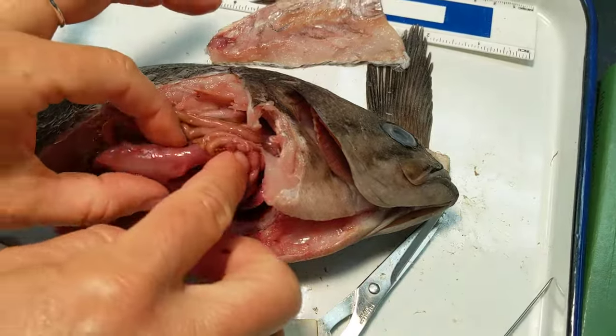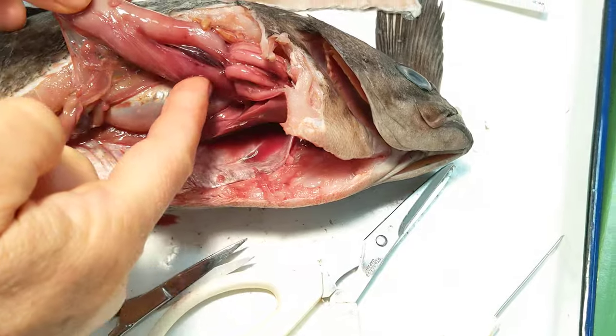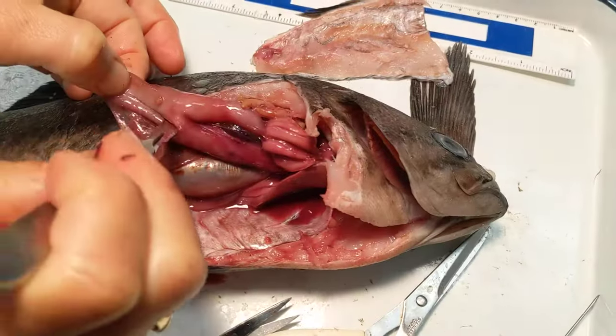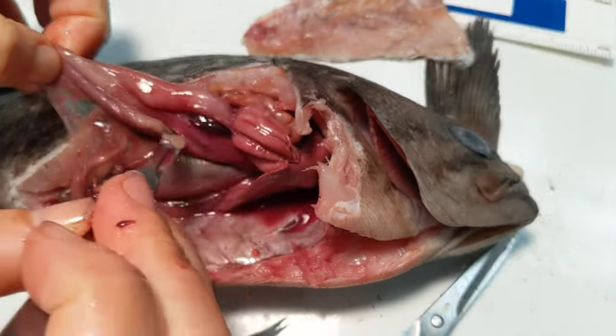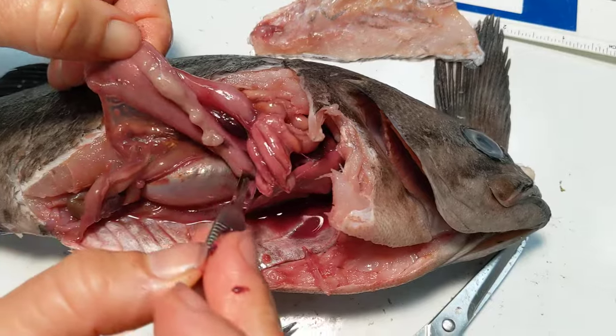If I flip it up, you can get a good view of this stomach. The stomach comes in here and then up, and then it wraps into those. We can just go ahead and slice this open and see if there's anything worth looking at in this stomach. It feels pretty empty to me, so this fish might not have enjoyed a last meal.